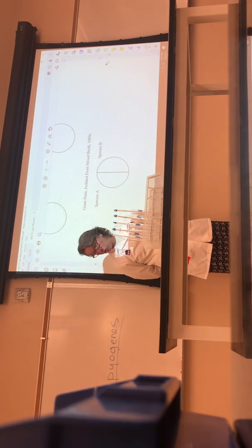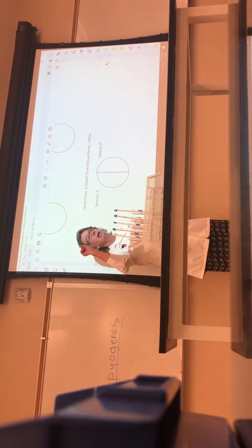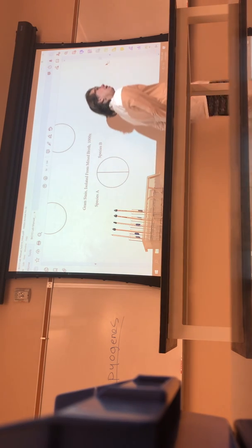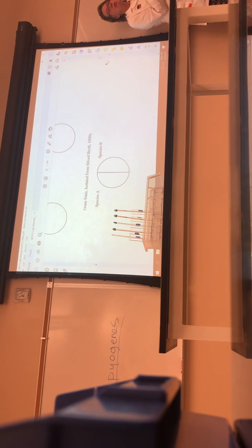So while we're waiting for things to dry here, we're going to make, yet again, 2 more gram stain smears. Only now you should know a little more, okay? So all of you need to gram stain your slant. That means take a small pinpoint or invisible amount and make sure what you got on that slant is what you think it is.